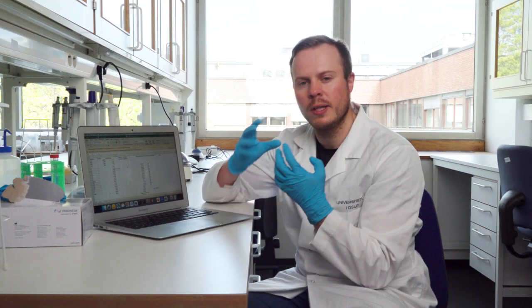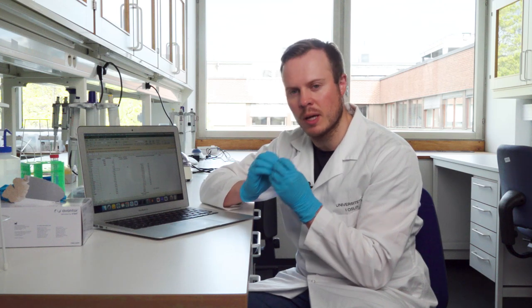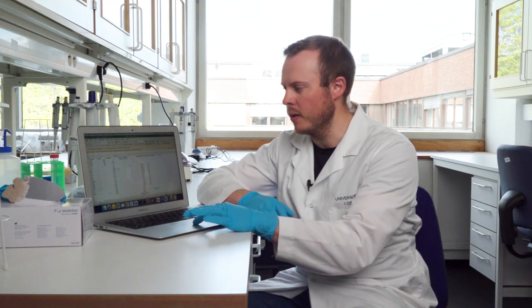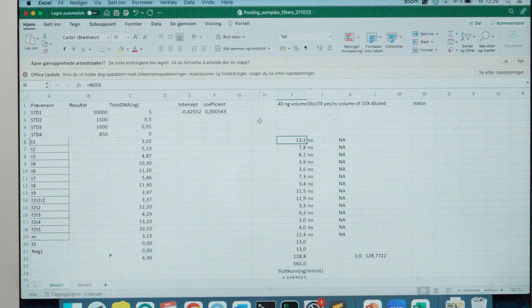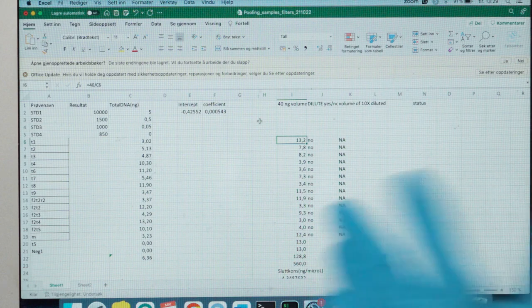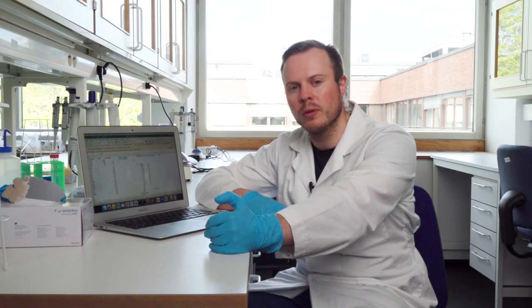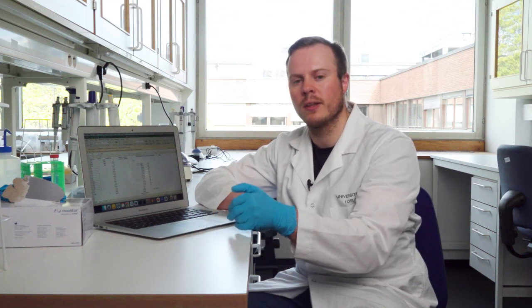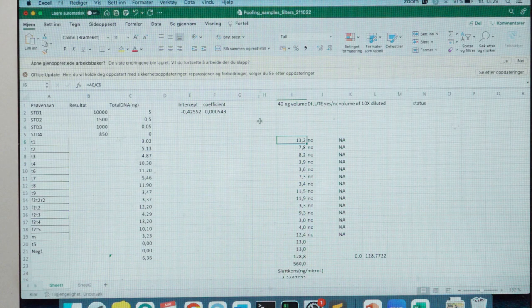So then for the pooling, as I have stated earlier, we need to get the same amount of DNA from each of the samples, so they are in equimolar concentrations. So here we use a simple calculation that is already in these forms to find out how much volume do I need to take out from sample one to get out 40 nanograms of DNA.